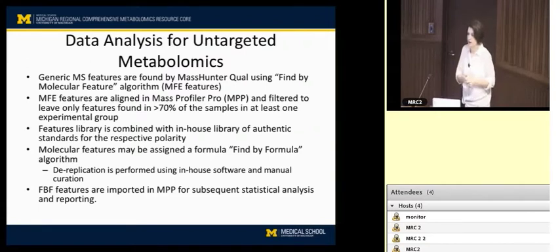If you have really excellent reproducibility, then when you look at your peaks, they should all line up anyway, and so that step may not be particularly crucial. If your chromatography is not great, some of the software can bring those peaks back into alignment by adjusting retention times. But the recursive part of it is probably the more important part.